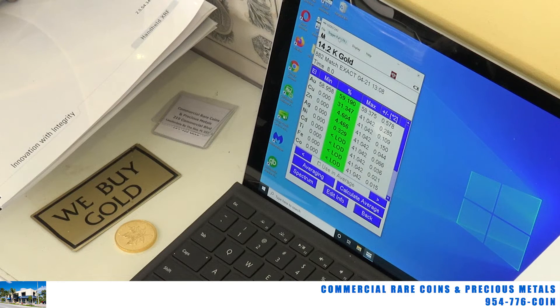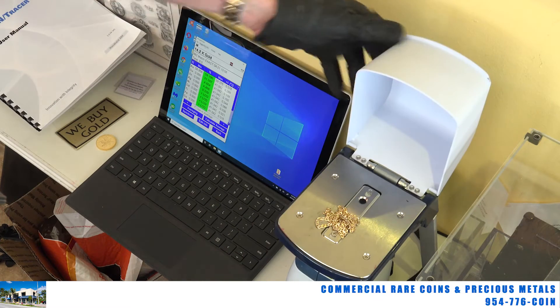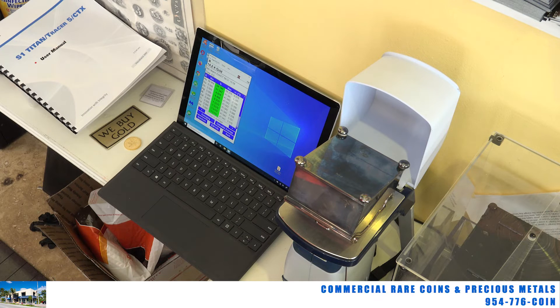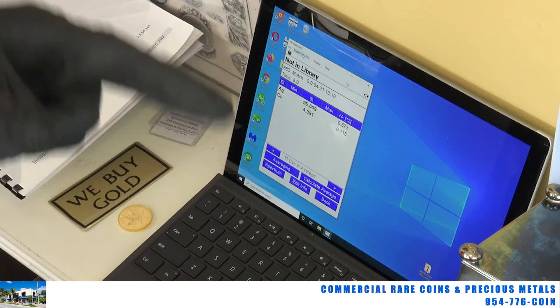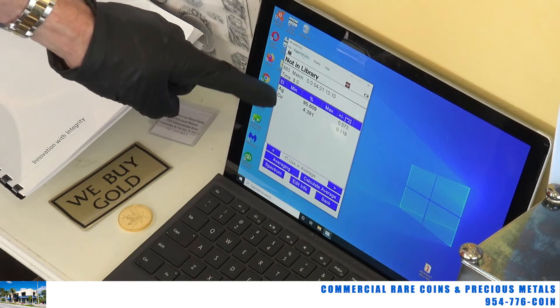So again, we're just shooting the surface. I'm going to take a silver item here, which is silver plated — it's a heavy silver plate, English made. This should, if I'm correct, read as silver even though it is not. We're going to hit the trigger. If you were to assume that this XRF was reading inside the metal rather than just the surface, you would assume this is silver. And it's showing up as 95.6% silver, even though it is plated and has copper on the inside. It's probably only 15–20 microns worth of silver, and this XRF device can't read past that.